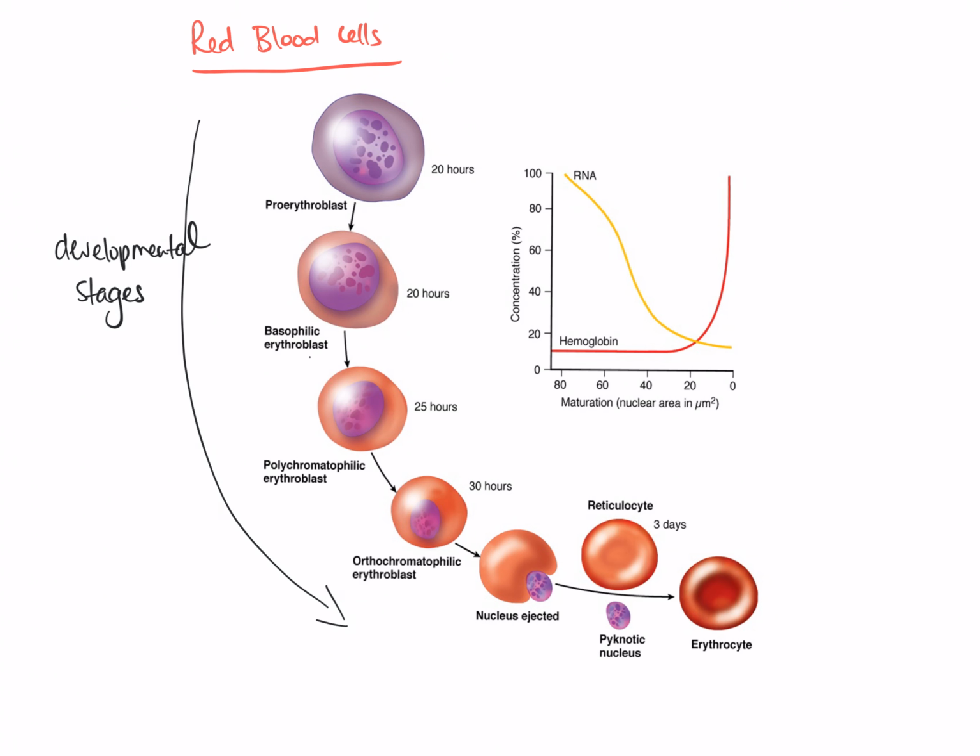Now, why would this be, Daniela? Why are they losing all organelles within the cell? So the purpose of an erythrocyte, which we should all know, is to simply carry oxygen in their 120-day finite lifespan. The way they do this is by the carrying capacity of hemoglobin molecules that they contain and the iron present within it. Excellent.